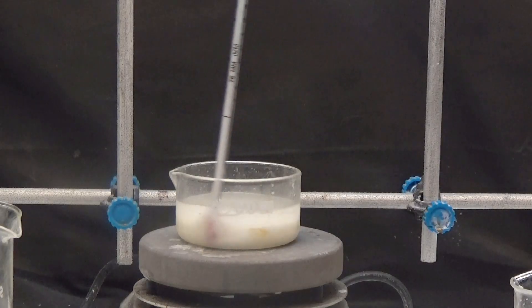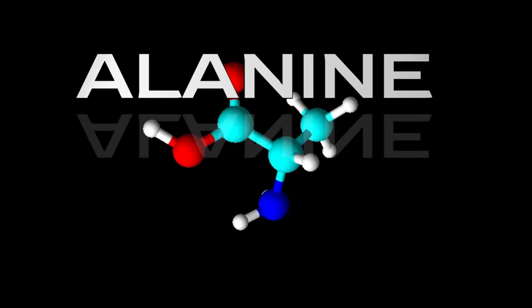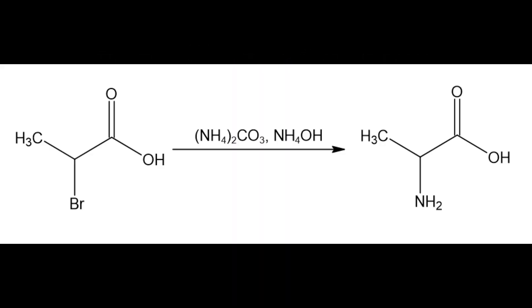In this video we are going to see how to prepare alanine. Alanine is a non-essential amino acid for humans and is part of the proteins of living beings. In this operation we are going to obtain alanine by reacting ammonia with 2-bromopropanoic acid.